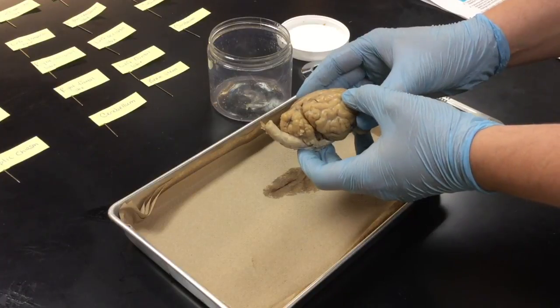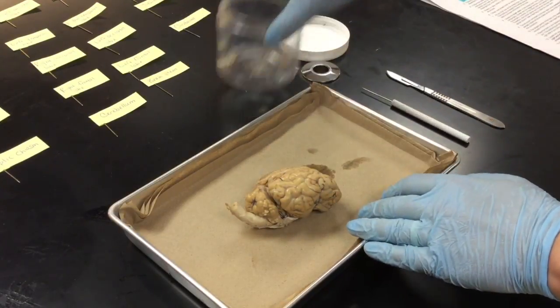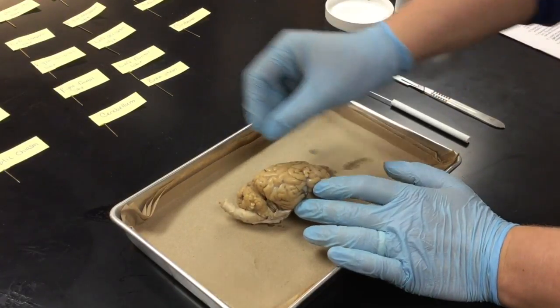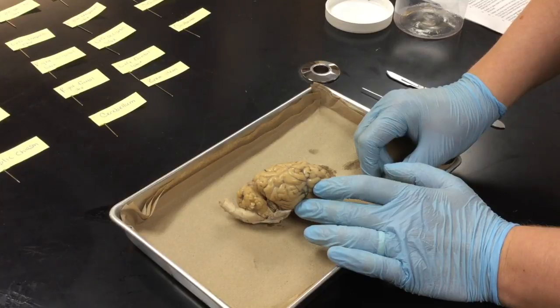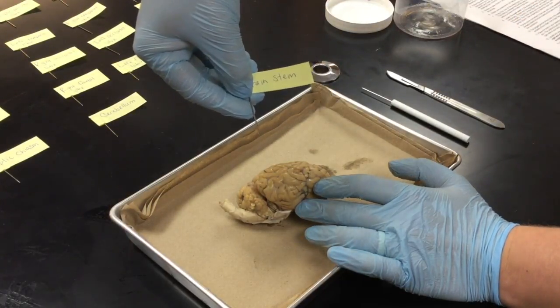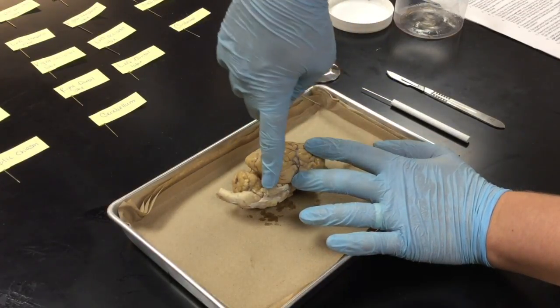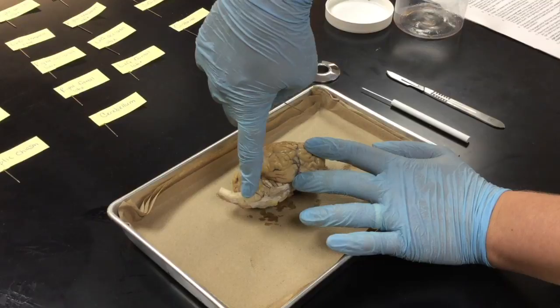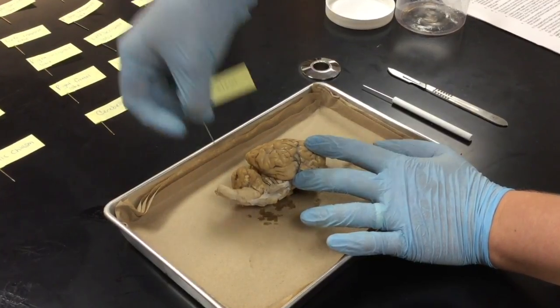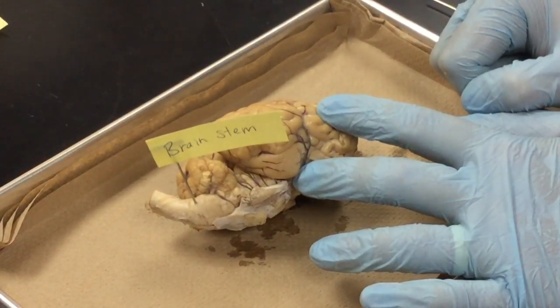So the first thing that we have to be able to identify is going to be the brain stem. So using your pre-made flags, what you're going to do is just take your flag and put it into that particular region of the brain. So here you can see I have the brainstem. The brainstem is going to be located on the bottom part of the brain. It looks like a little tiny cord that's going to come off the brain itself. So you just want to take your flag and place it directly into that particular region.